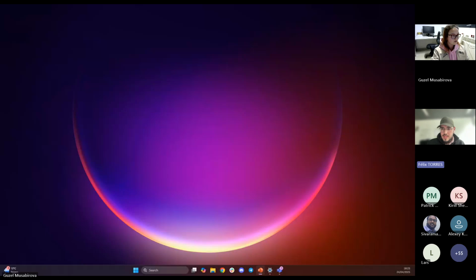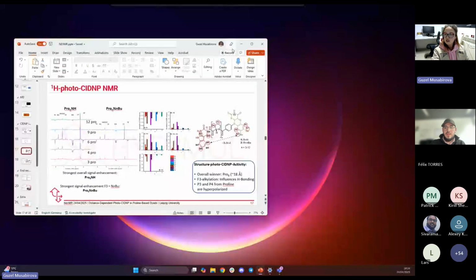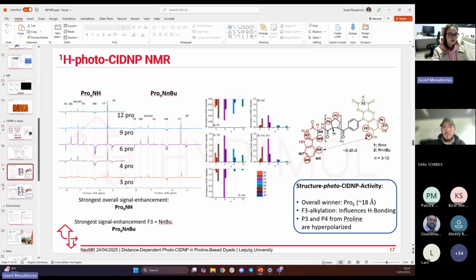All right, thank you. Next question is from Matthias Bütikofer: thank you for the nice talk. Did you also compare the CIDNP of the linked system with that of the unlinked system? Yeah, sure. We have done a comparison for the same construct, from this flavin with the benzene ring and this tryptophan without any proline linker.